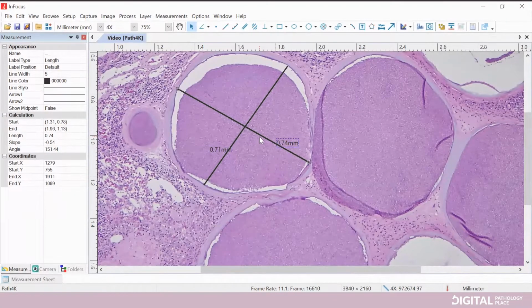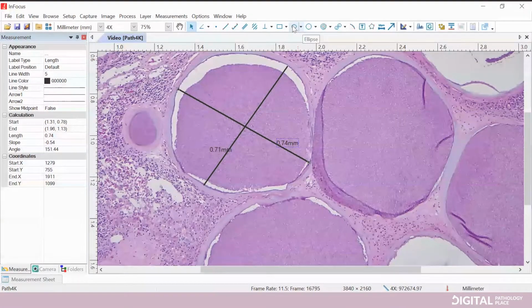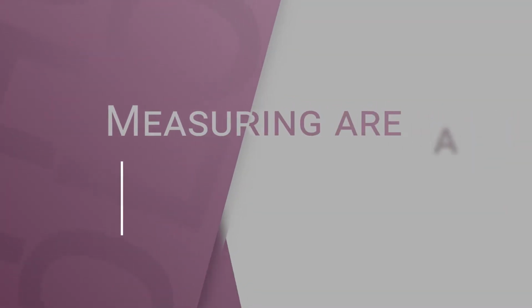So now we are still in video live view, right? Yep. So if we wanted to have this on our image for later reference, we just snap it, right? Let me show maybe another measurement or two first, and then I'll go over how to capture and save everything, if that's okay with you. Because we talked about also the area.